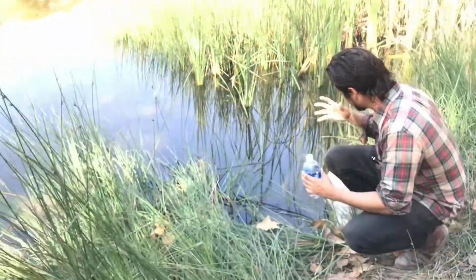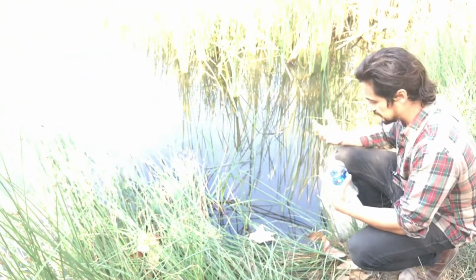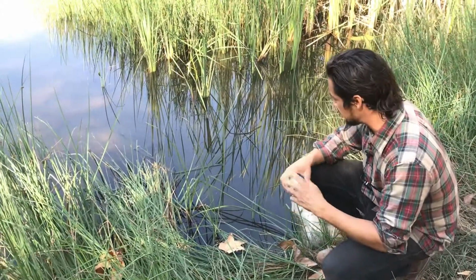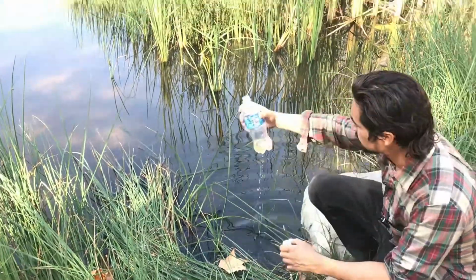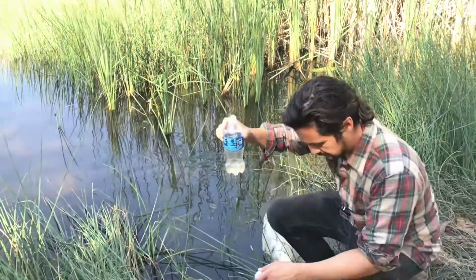And this is where you're going to collect from, somewhere like this. I would actually want a place that's a little more filled with algae than this, but for the example, this will be fine. So I take my container, I'm going to fill it, try to get some grime in there. That looks good. This should be plenty of water to start exploring.